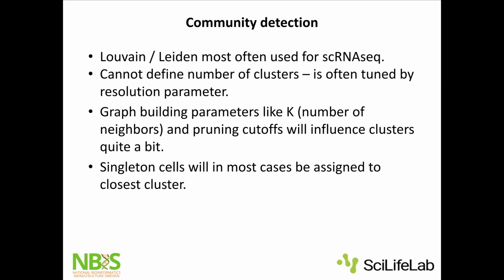So we have this resolution parameter that says something about how we should weight the within and between cluster similarities in these algorithms. Depending on how we tweak the resolution, we will get a different number of clusters. Also, if we tweak K or the pruning parameters and so on, we might get more or fewer clusters from our graph.